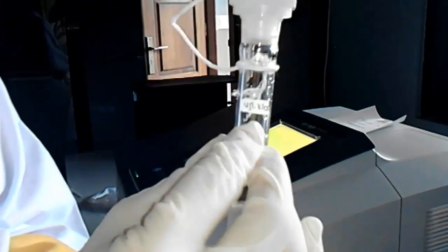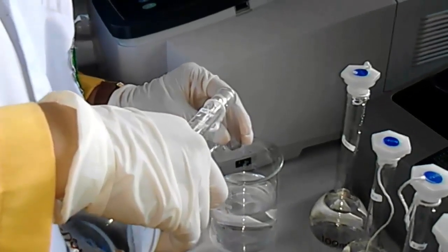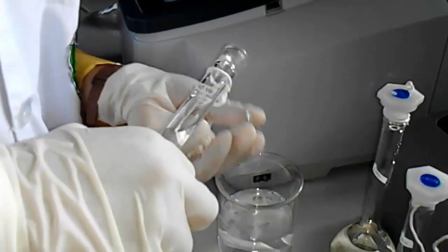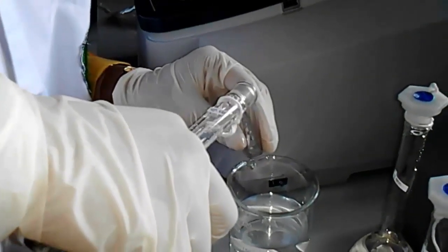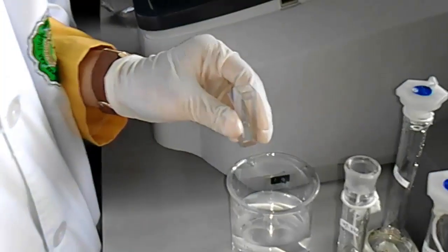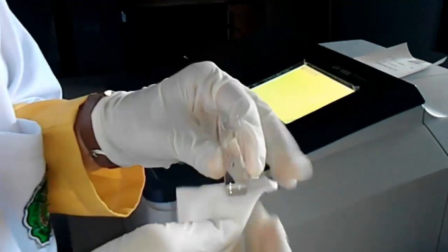And this is the sample of chloramphenicol. Wash off the cuvette with the sample of chloramphenicol. Then fill up the cuvette with the sample of chloramphenicol. Wipe the clear side of the cuvette with tissue.